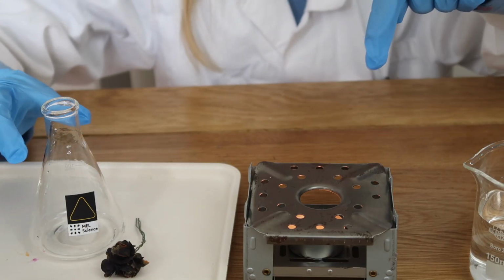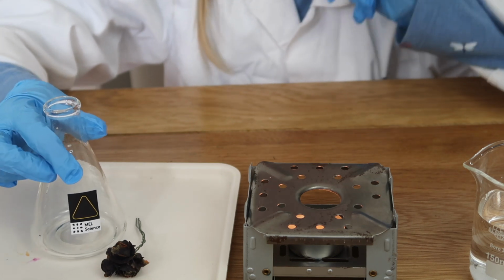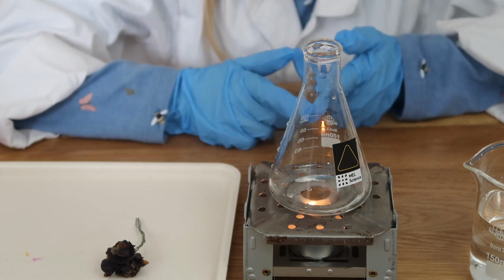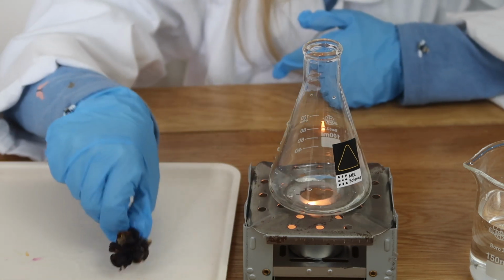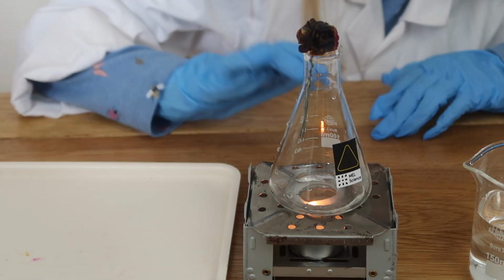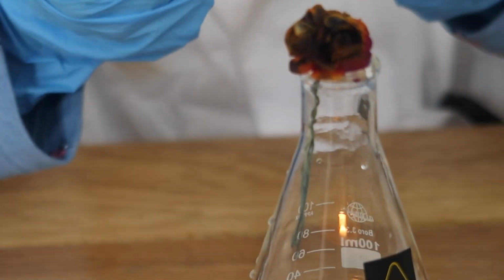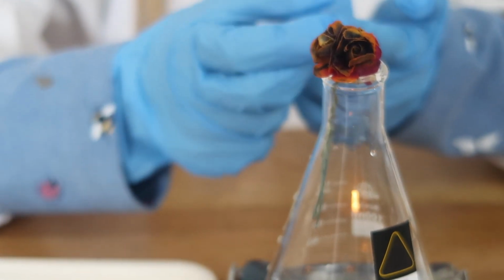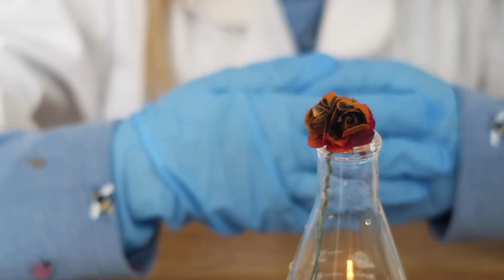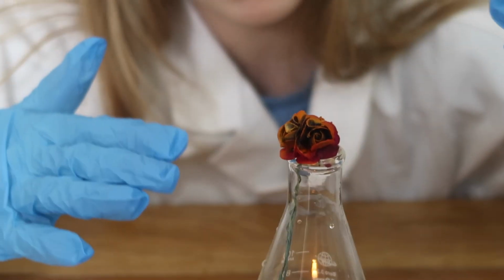Next step is, you can see this is lit by a responsible adult, aka my mum, and I'm going to place it on top of the little stove. And then place the flower on it. Carefully. Oh, it's gone red. So hopefully the fume should go up onto the flower. As you can see, it's changing orange.